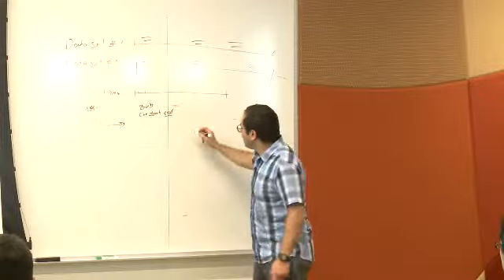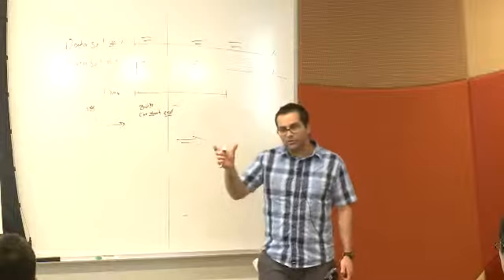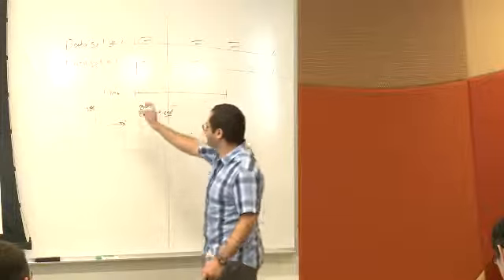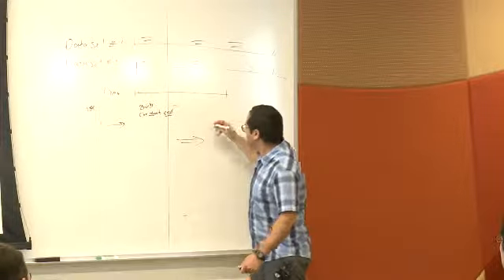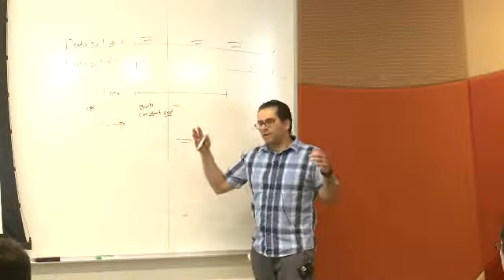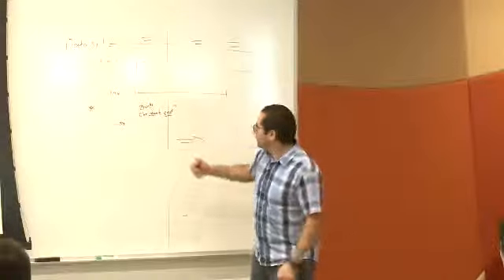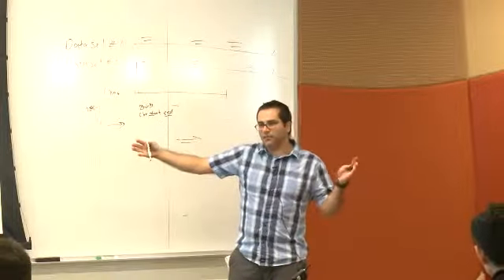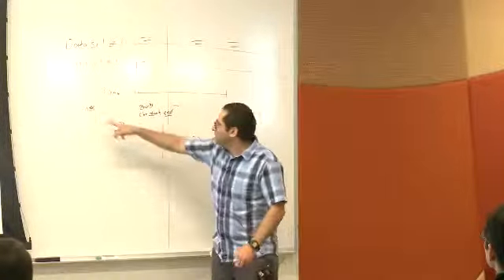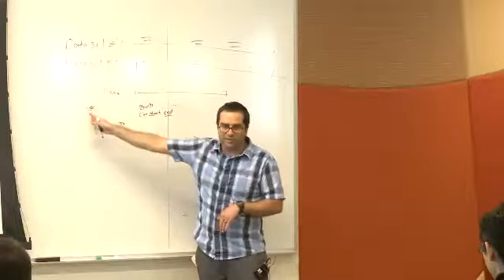And then using these two files, together with a decision of what size of genomic areas we want, we can look, for instance, at enhancers with 20 kb around them. But we can look within these 20 kb at fragments of 1 kb or 300 base pairs or whatever we want, as long as, this is the highest resolution, 25 base pairs.